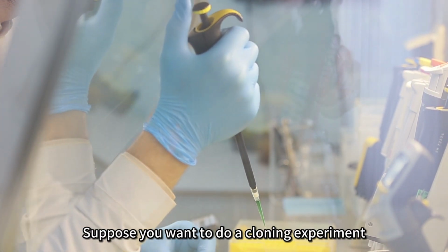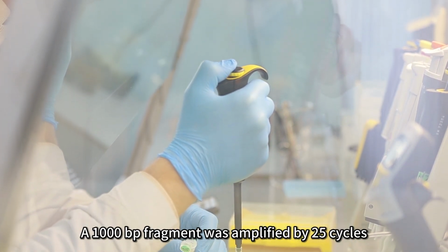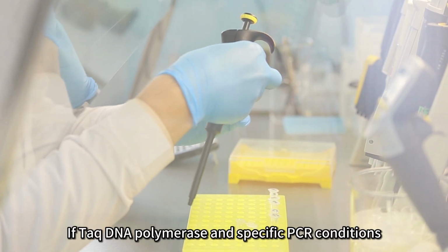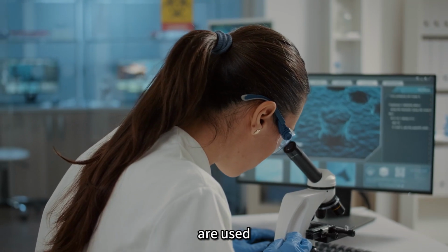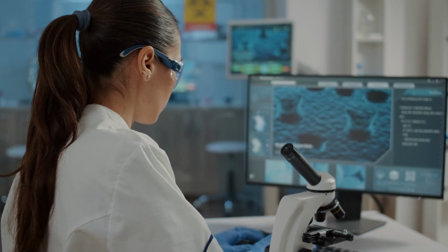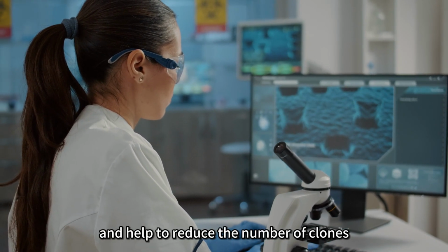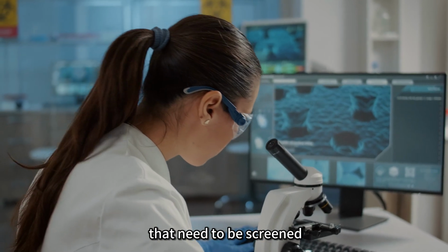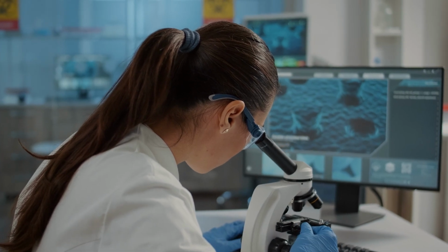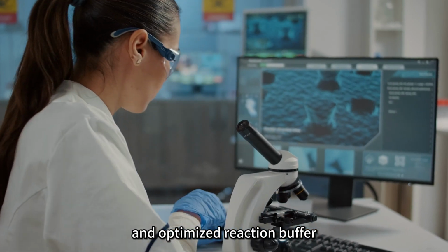Suppose you want to do a cloning experiment. A 1000 bp fragment was amplified by 25 cycles in the construction of PCR. If Taq DNA polymerase and specific PCR conditions are used, more than half of the clones are expected to contain a mismatch. Using a proper DNA polymerase could make fewer mismatches and help to reduce the number of clones that need to be screened. To maintain the highest fidelity of polymerase, we should use a high-fidelity enzyme and optimized reaction buffer.